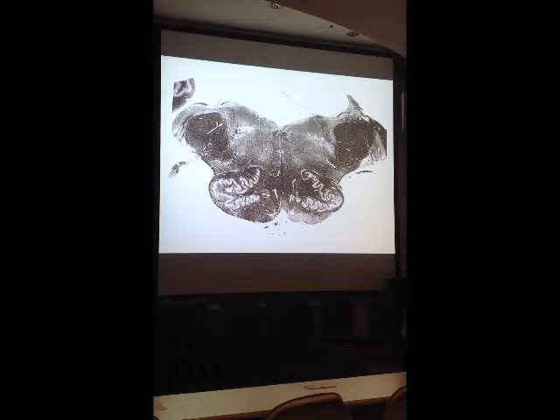Then we have this structure right here. Name this big nuclear structure. It's not just the olivary nucleus, it's the inferior olivary nuclear complex. So the inferior olivary nucleus is what we're looking for here.